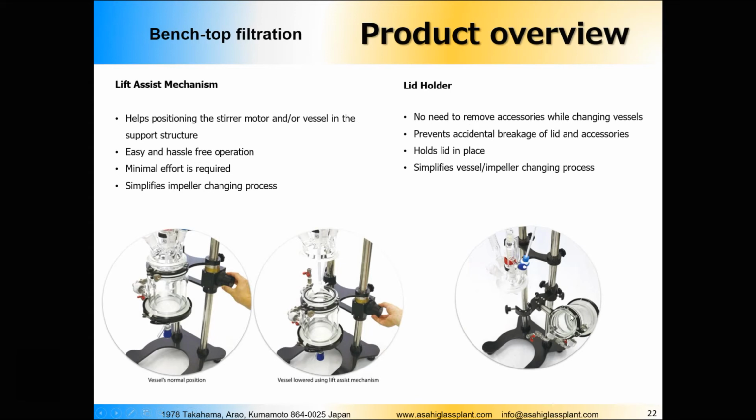to discharge the product. And there is also another tool, a lift mechanism, which allows you to lower the filter vessel just by rotating this knob here. It is, well, let's be honest, relatively expensive, but it really helps you when you have a very heavy vessel, or maybe if you're a lady, then you will definitely need it to do the lowering on your own.